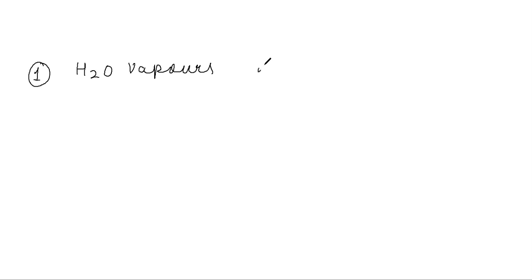So it is definitely colorless, and it does not have any smell also, so it is odorless. Now you don't know yet that it is water, right? So just observation is going on. It is colorless and odorless.